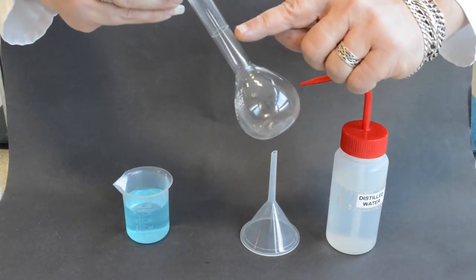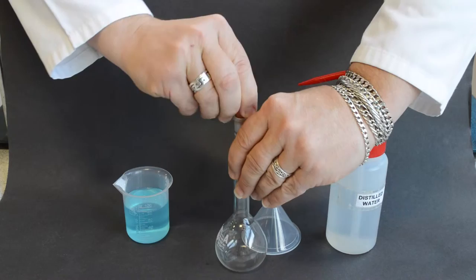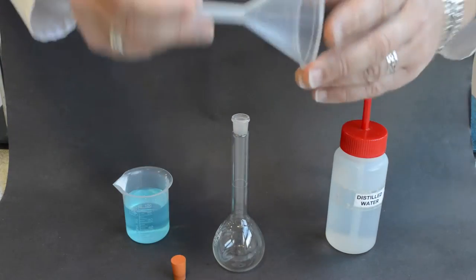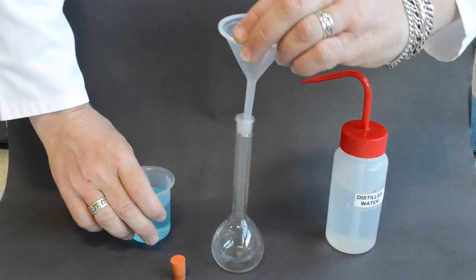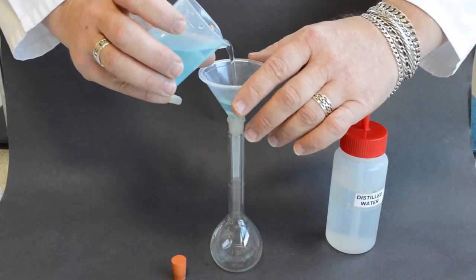Using a volumetric flask, make the sample up to precisely 100 milliliters. Use a funnel to transfer from the beaker to the volumetric flask.